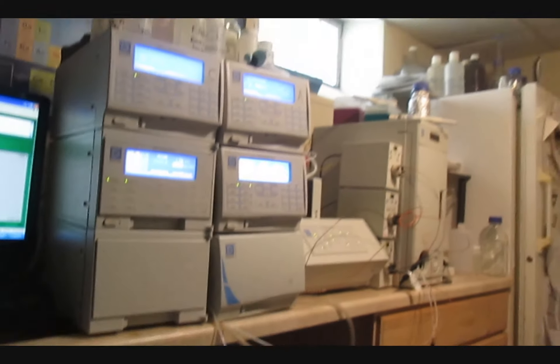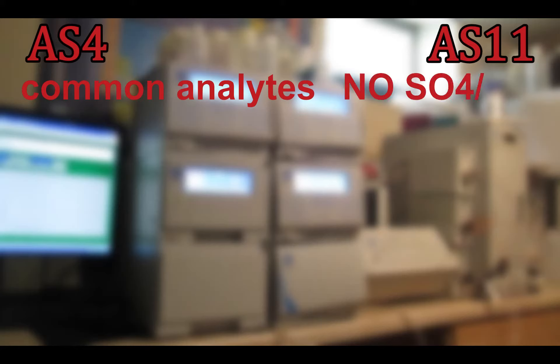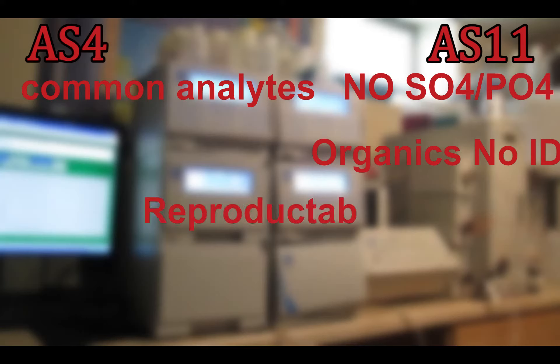But let's compare the two columns' pros and cons. The AS4 is able to detect seven analytes mostly found in nature and industrial application. The AS11 could not reliably pick up sulfate or phosphate at all. The AS11 could easily detect organic anions, but sometimes identification was difficult. Both of these columns had good reproducibility.